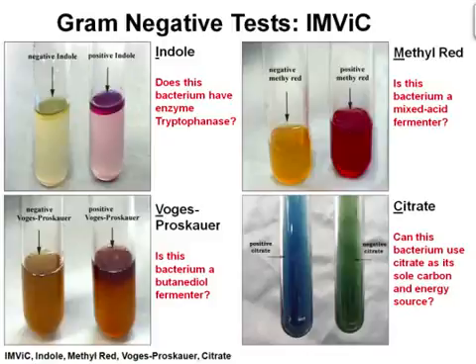Enterics that subsequently metabolize pyruvic acid to neutral end products, for example Serratia marcescens and Enterobacter aerogenes, lower the pH of the medium to only 6.0. At this pH, methyl red is yellow. A yellow color represents a negative test. pHs in between 4.2 and 6.0 will change the pH indicator color to orange.